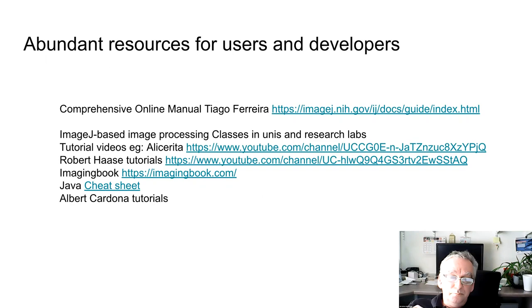If you have never done image processing, it's still a good software to start, because there's a huge amount of resources for users or for developers to start using or developing image processing software. Of course, there's the very comprehensive online manual, which is maybe a little bit outdated. That's a point maybe to raise. And there are a lot also, this is mainly for users.